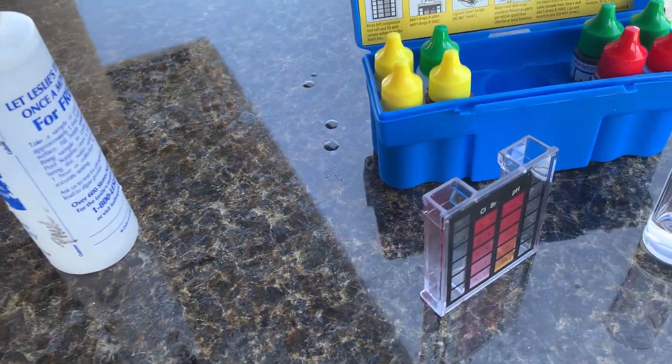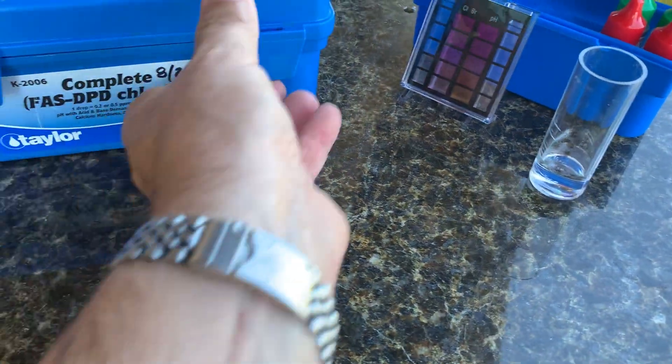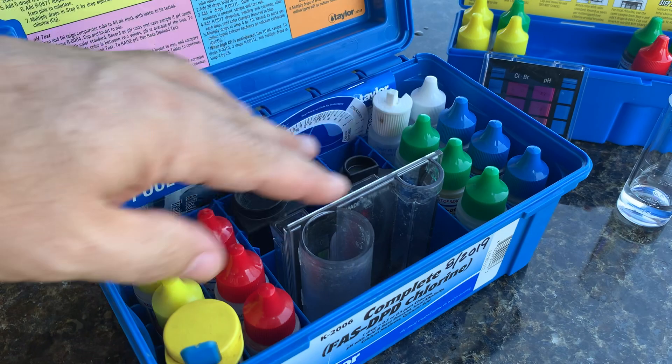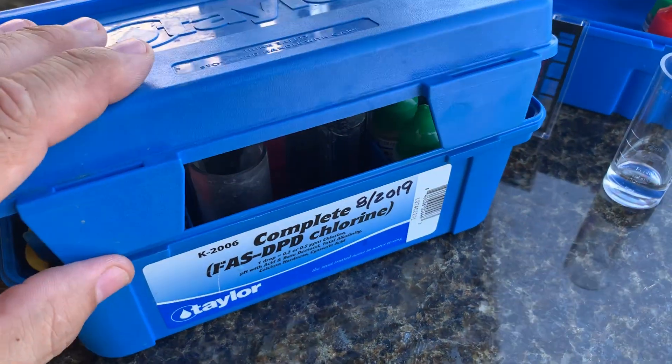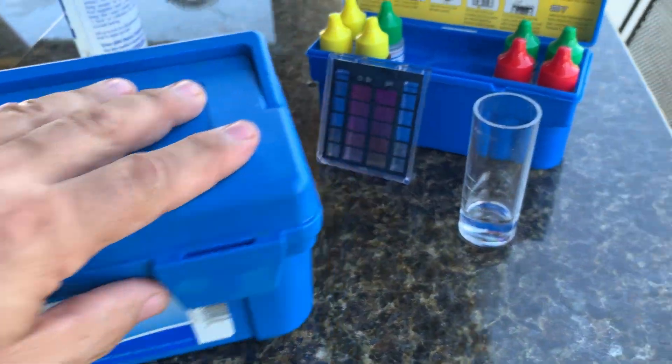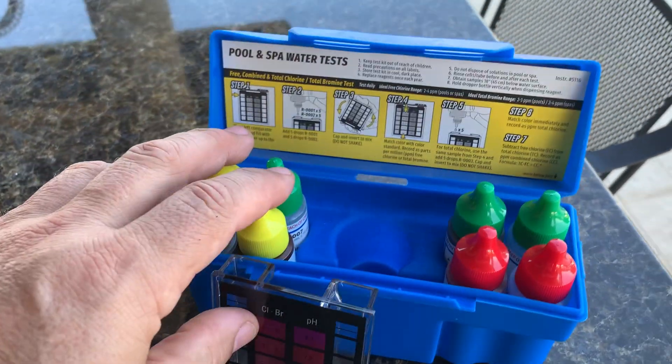If you need more detail, you'd want to get a larger Taylor set like one of these — this is a K2006. It's got most of these same pieces but more for calcium testing and CYA and other things. But for your day-to-day stuff, this is good because it's cost effective and you've got plenty in here to do a lot of tests.